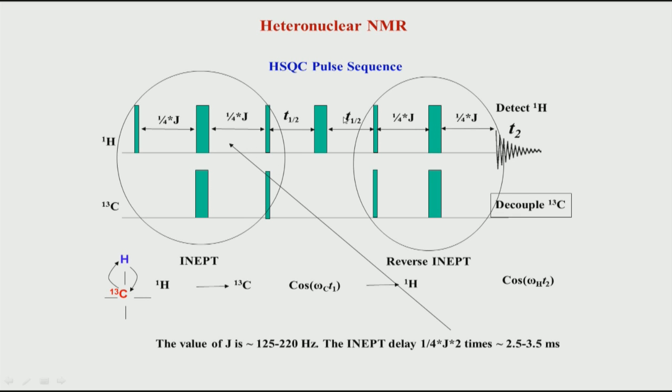The ideas in HSQC that we discuss right now are applicable to many 2D experiments in heteronuclear NMR in general. That is why we spend more time on this experiment to understand the integrities of these experiments. One thing we discussed yesterday again was decoupling: when you are acquiring or detecting protons during this period, you have to decouple from the carbon, because carbon is what is coupled to proton by J coupling. Now, one has to keep in mind the following.